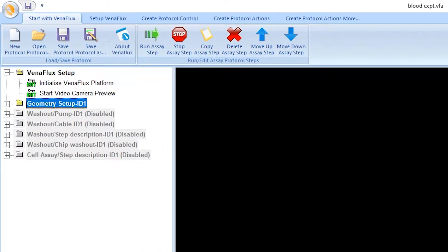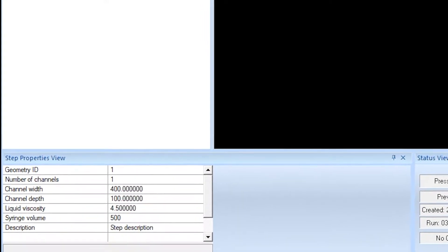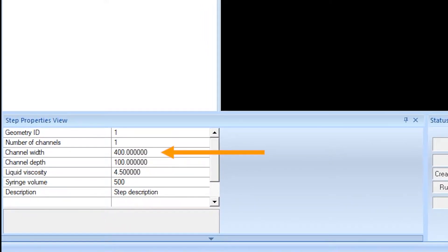This reveals the step properties which default to those for the Vena 8 fluoro plus chip, which is the most popular biochip for thrombosis assays. The channel width is 400 micrometers and the channel height or depth is 100 micrometers. The liquid viscosity is automatically set for whole blood, which is 4.5 centipoise. For any other liquid such as buffer or culture media, this would be 1 centipoise. The syringe volume is 500 microliters, as this is usually the size of the syringe used for thrombosis experiments.